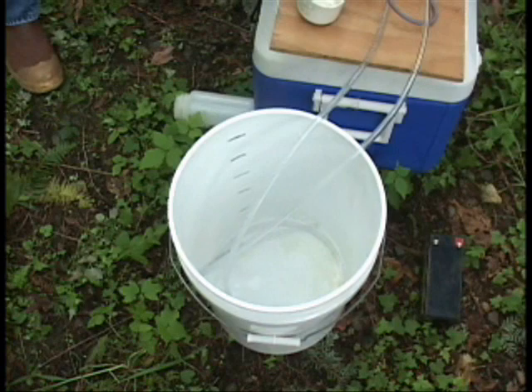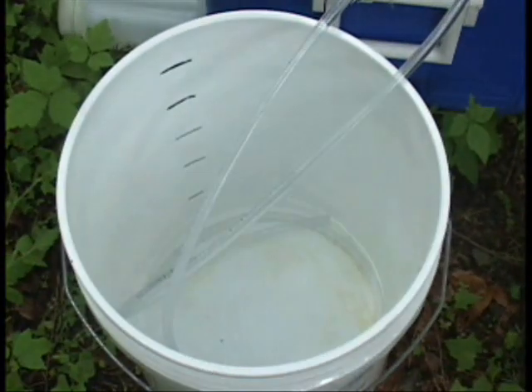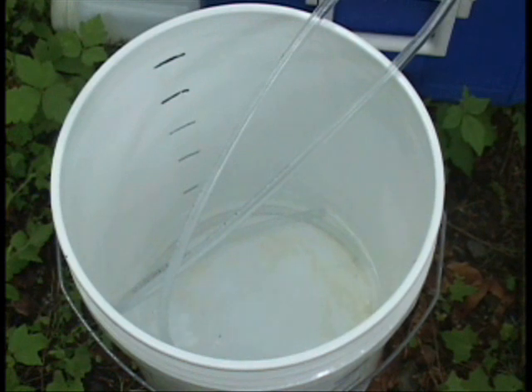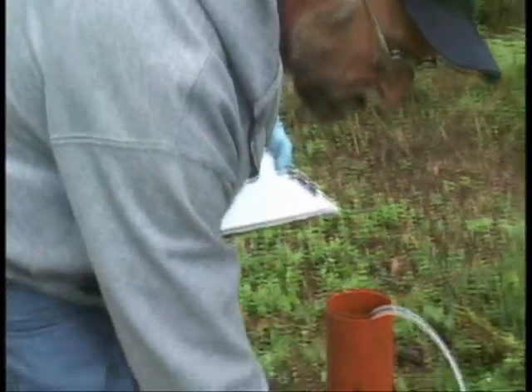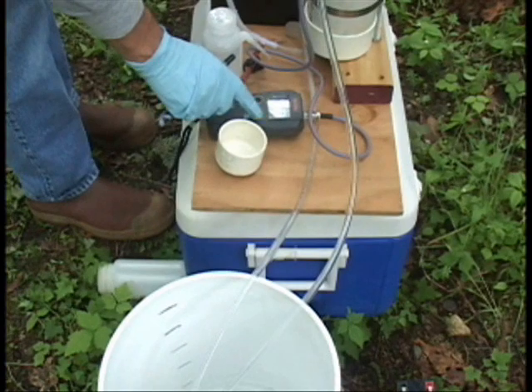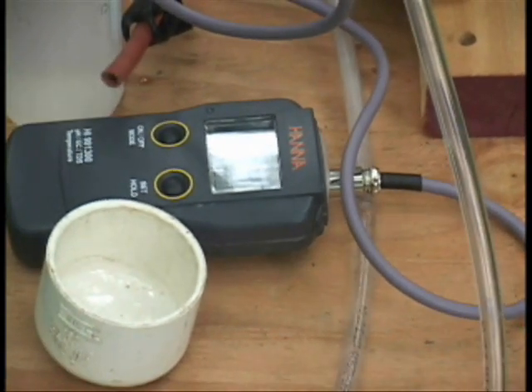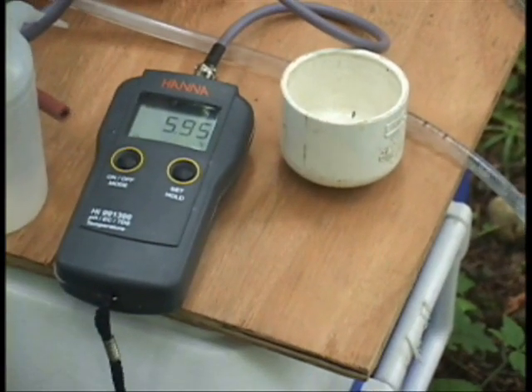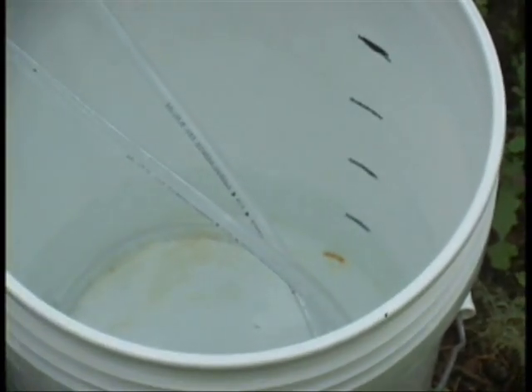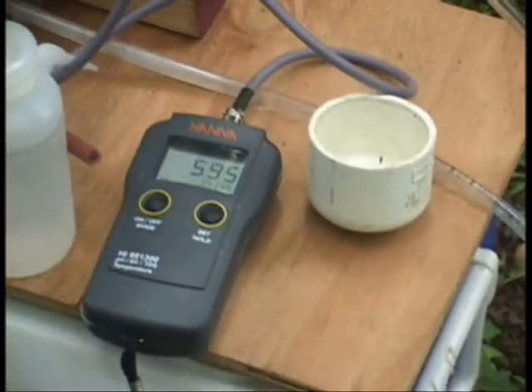When we hit one gallon we'll take our first reading. We've calculated 1.3 gallons as one well volume. The pH is about 5.98 right now, and conductivity is very low at 47, which is lower than typical groundwater. At each gallon increment I'm going to take the unit to see what our field readings are.